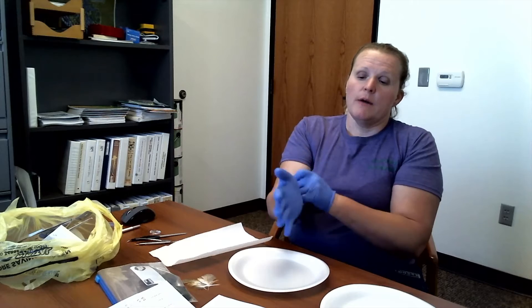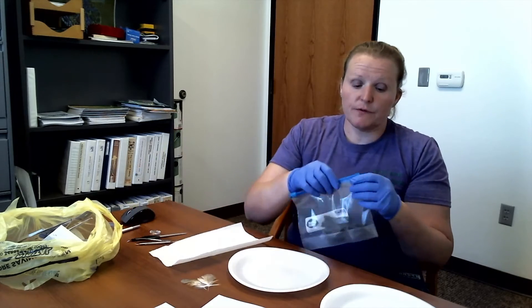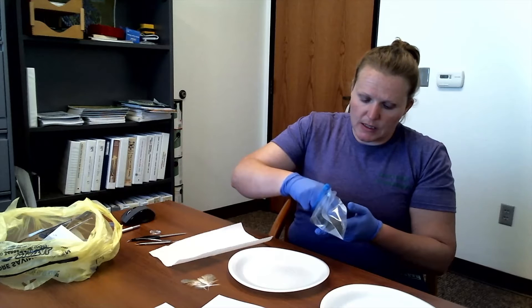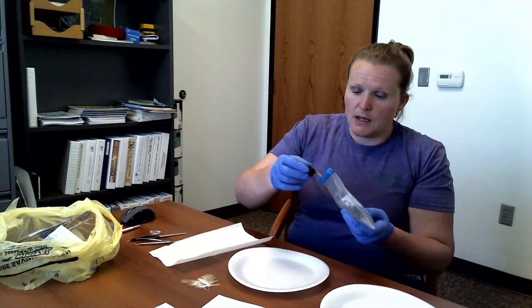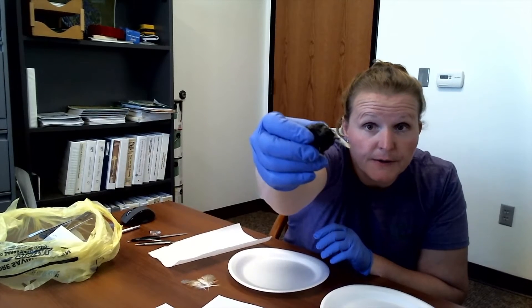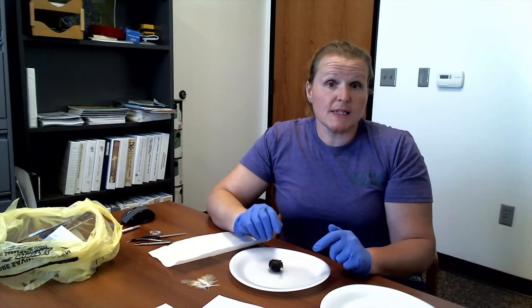We're going to get started — glove up first. We're doing this just to keep my hands clean. Also, you never know what you're going to find inside, so if there's something sharp I may not want to get poked, but using your tweezers should help as well. I'm going to grab an owl pellet. These were fresh as of yesterday. I'm going to pull it out and the first thing I notice — not huge — but there's a songbird feather sticking right out of this pellet. So we're going to get started.